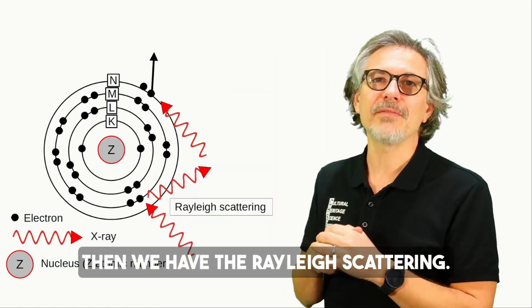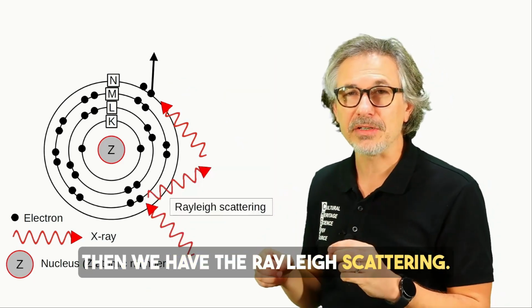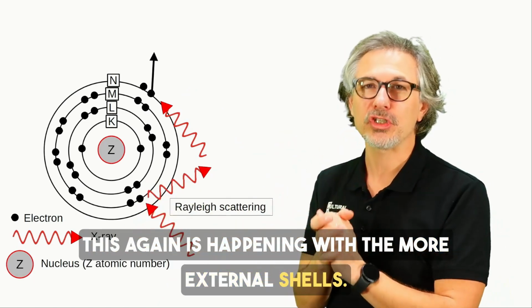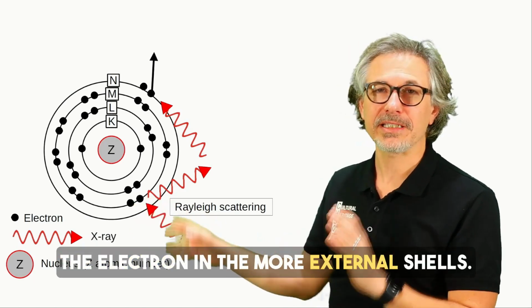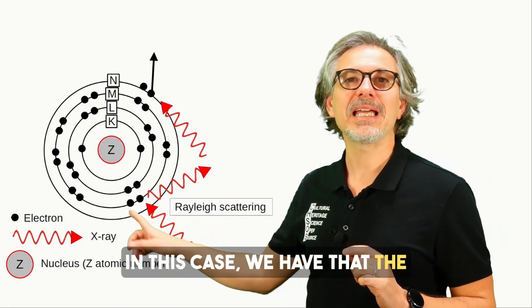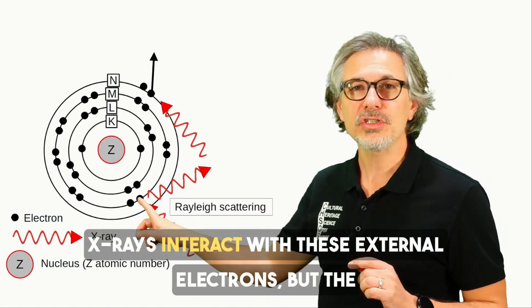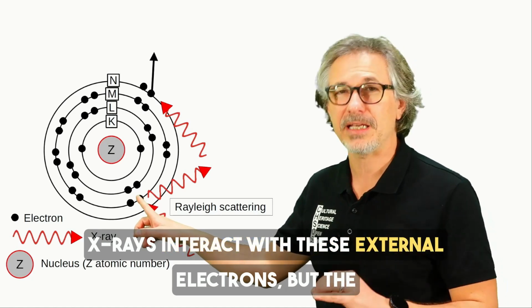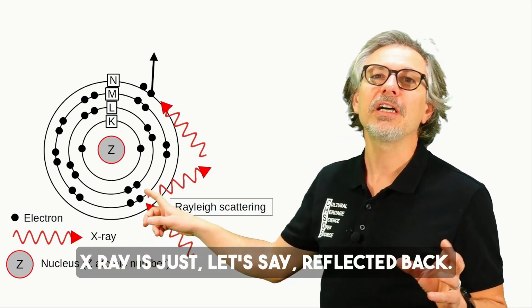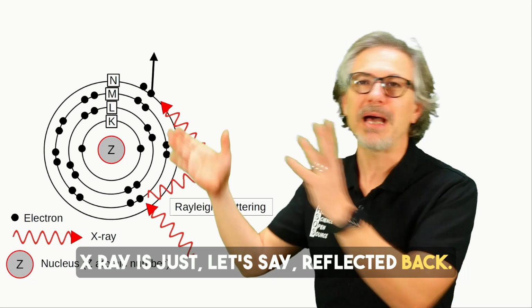Then we have the Rayleigh scattering. This again happens with the more external shells, the electrons in the more external shells. In this case, the X-rays interact with these external electrons, but the X-ray is just reflected back.